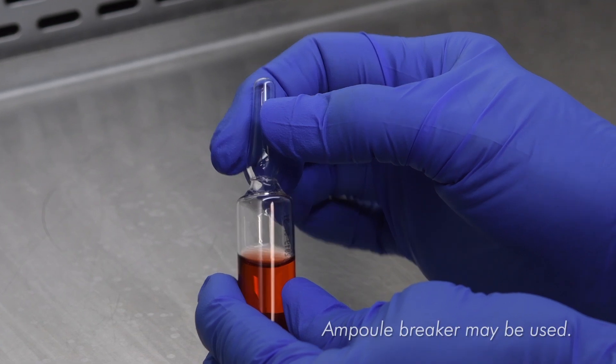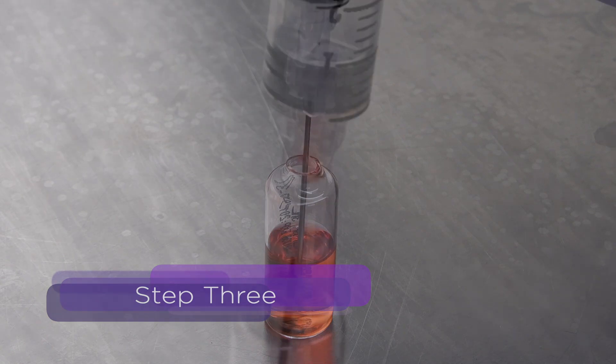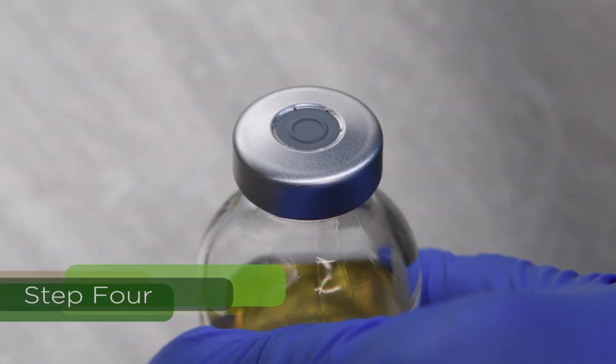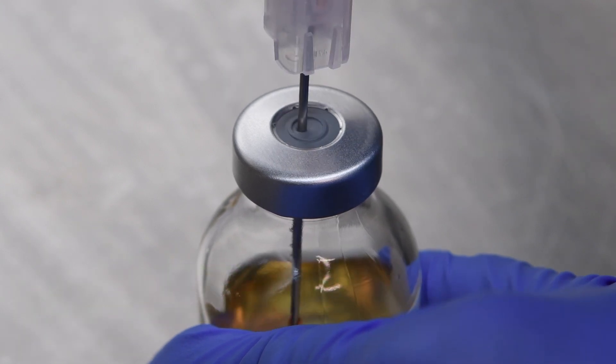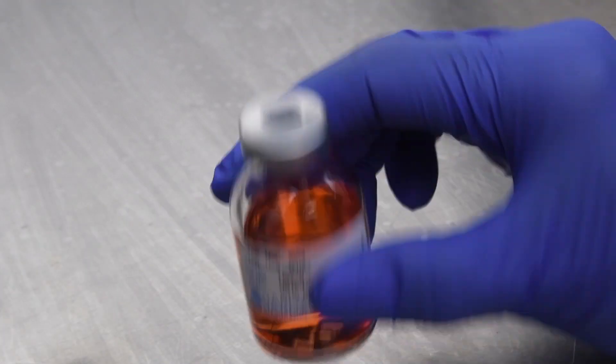Carefully break the top of the ampule at the score line. Draw up the entire volume of the ampule contents into the syringe. Inject the entire volume of the ampule media into the TSB serum vial and mix the vial to evenly distribute the contents.